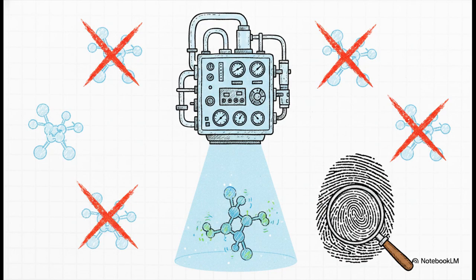What's truly staggering here is the sheer scale of precision we're talking about. High-resolution mass spectrometry, or HRMS for short, boasts an accuracy of about plus or minus 0.005%. To put that into perspective, your standard chemical methods for finding molecular weight are only accurate to about 1%. These highly specialized, incredibly expensive HRMS machines are so precise, they just completely eliminate the alibis of all the other molecular formulas. It really makes it a definitive, open and shut case.